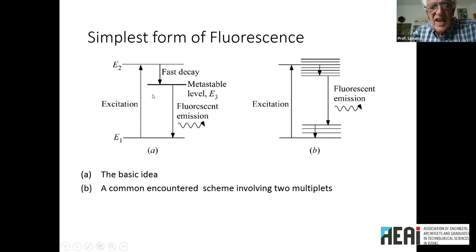On the other hand, when they fall down, they emit fluorescent emission. And that's the way you could recognize that this particular molecule was excited. So that's the way the fluorescent molecules work. And they're used generally for chemical reasons. The molecules attach themselves to certain parts of the object, and the fluorescent emission comes from those parts of the object which are connected chemically to the fluorescent dye.